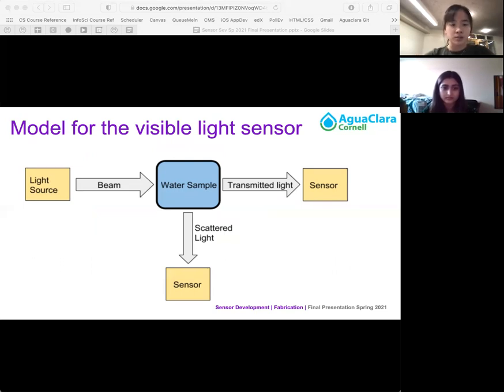But at a very high turbidity, the amount of scattered light will also decrease due to absorbance. However, the transmitted light would roughly be the same due to limitations in measurement. Having the second sensor will help us get a better picture of the situation. The implementation of the turbidimeter will lead to more accurate readings and analysis of the turbidity using the infrared sensors.